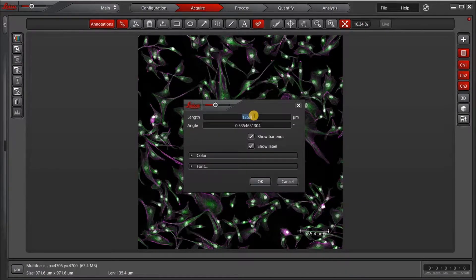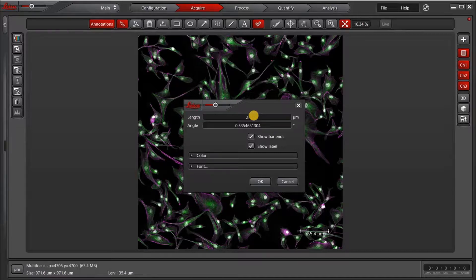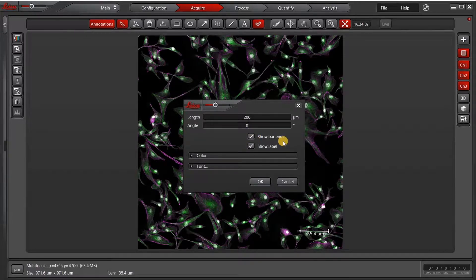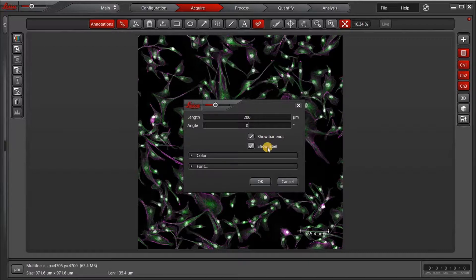Now I can adjust the scale bar as I want, so then let me put in 200 microns and a zero angle because I want it to be straight. I can also select whether I want to show the bar ends and also show the label.